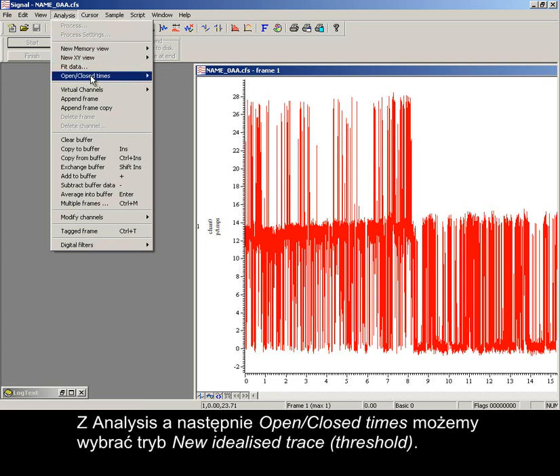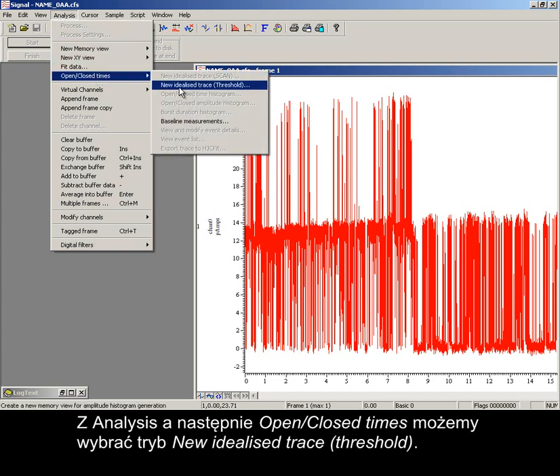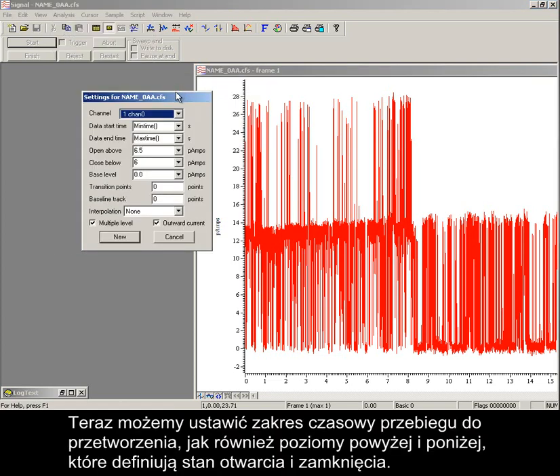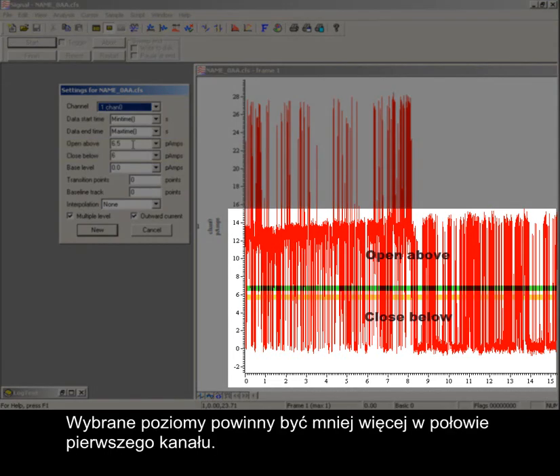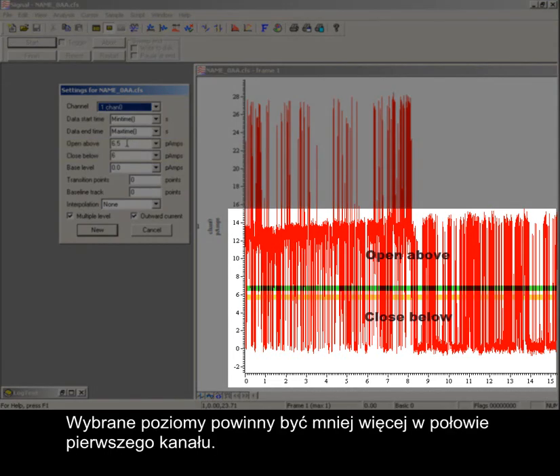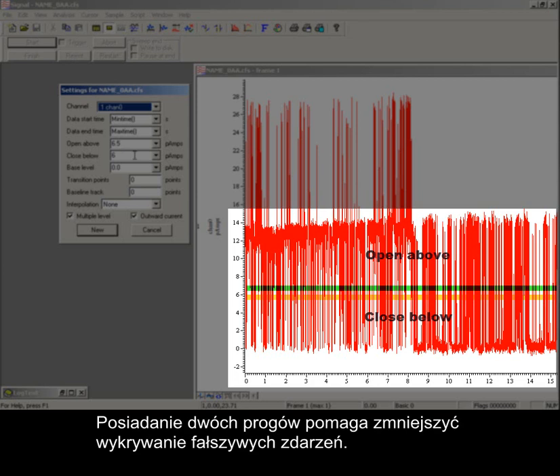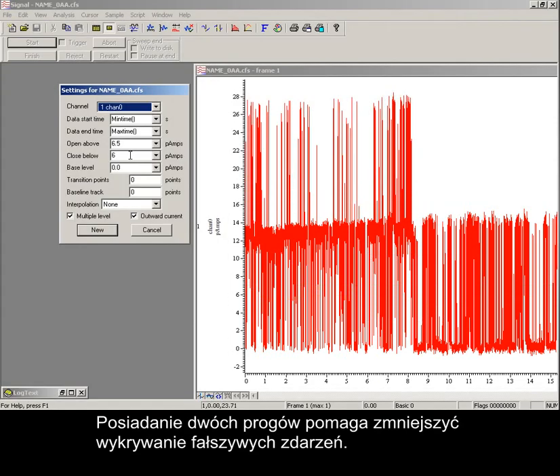From analysis, then open-closed times, we can select new idealized trace threshold mode. Now we can set the time range of the sweep to process, as well as the levels above and below which define the open and closed states. The levels to choose should be around the halfway point of the first channel. Having two thresholds helps reduce the detection of false events.